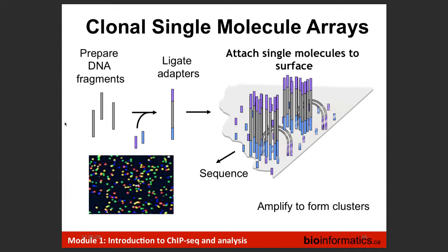So an overall correlation is about 0.9, 0.92 between ChIP-seq and MNase ChIP-seq. And what you see is that there are regions that MNase reaches into uniquely, and those are the ones that will tend to cluster that group together. And there are regions that cross-linking will reach into uniquely. So you get unique regions, the majority of it is shared, but when you're doing clustering and you're looking for 1 or 2% difference between samples, it's actually going to drive a difference. And so you certainly need to be aware of that.